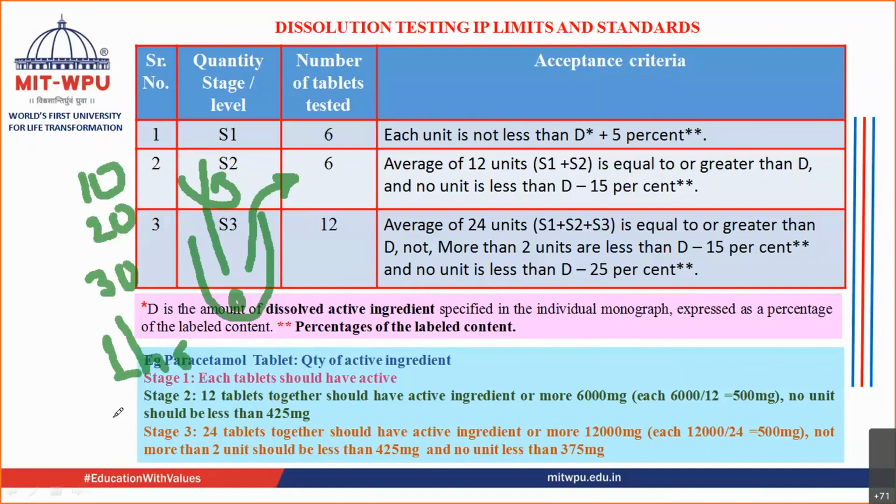And within the specified limit, as I told you, the time limit is given over there. In the specified time, how much drug has been released? That you find out. Got it? Okay. Let us move further now.